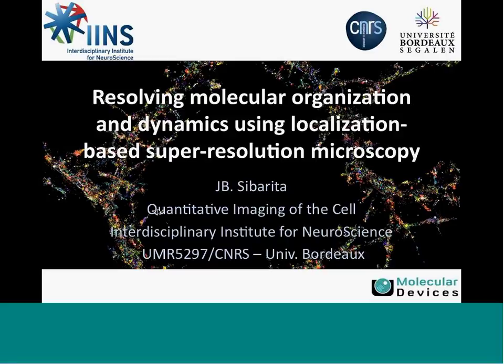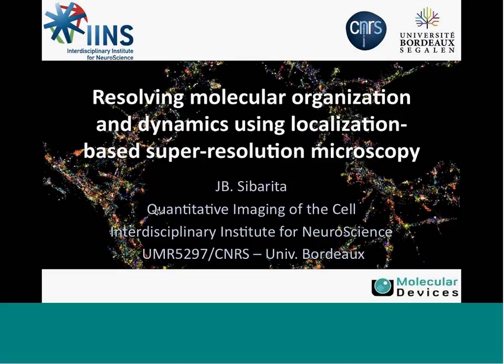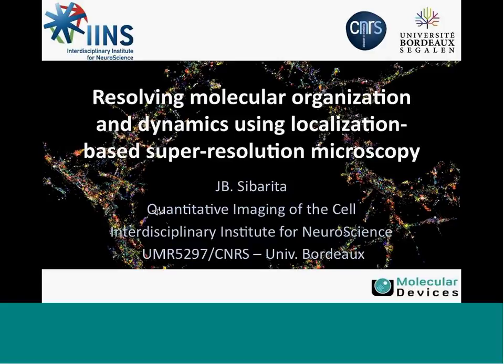In the third part of my talk, I will end with a nice biological application that we have performed in collaboration with the group of Daniel Choquet, showing how, thanks to this super-resolution technique, we have unraveled some new organization of postsynaptic molecules within neurons in live and fixed samples.